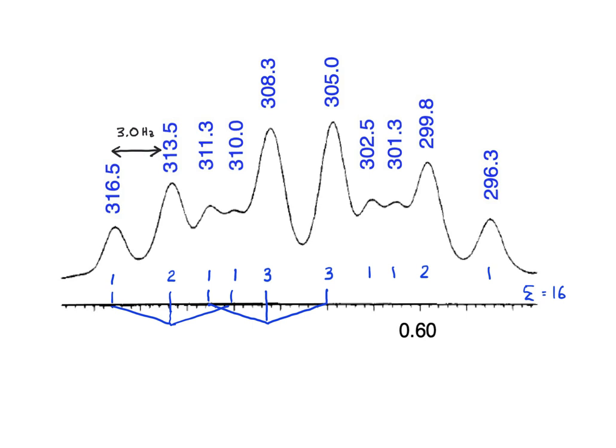So this is where it's worth going to the other side, building from the right side. Again, I see 3.5 hertz, but again, there is a little bit of error in these numbers. And now I see where those 3 peaks are making sense with a 1 to 2 to 1 triplet. Okay, so we have 4 triplets. And the triplet coupling constants are averaging about 3.5 hertz.